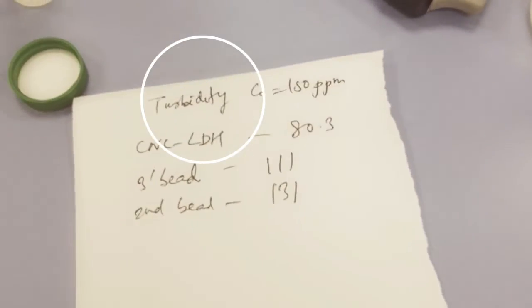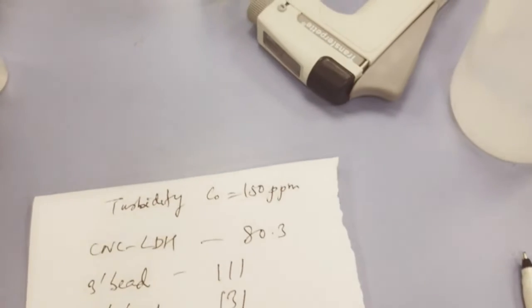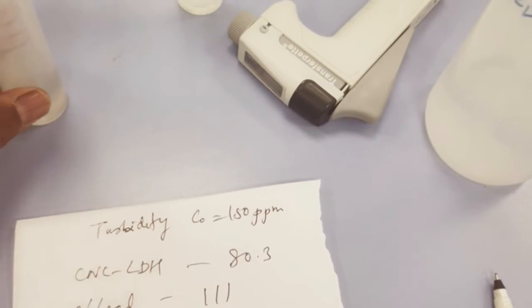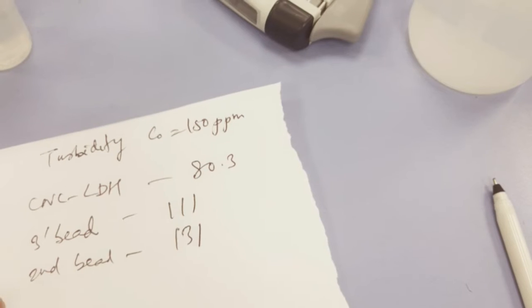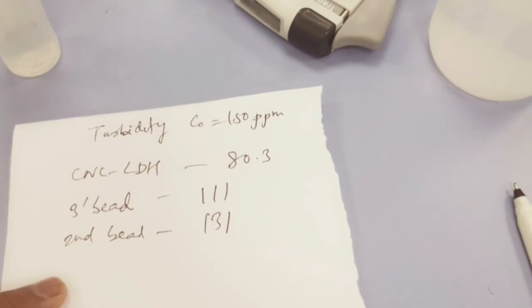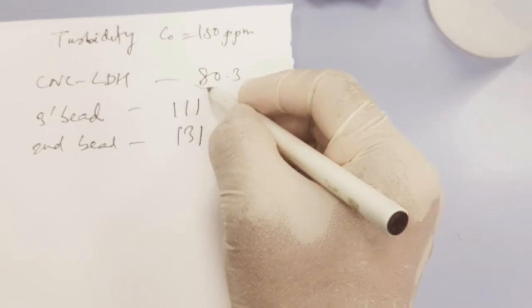So this was all about the batch oil adsorption. In order to segregate the oil and adsorbent from the water, you can do centrifugation, or you can also do filtration using a vacuum filtration technique or a syringe filter, and check the removal. So here our LDH performs better.